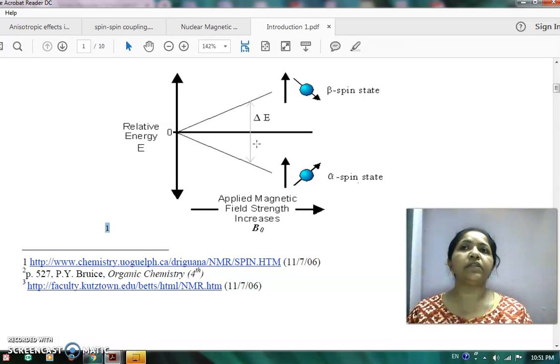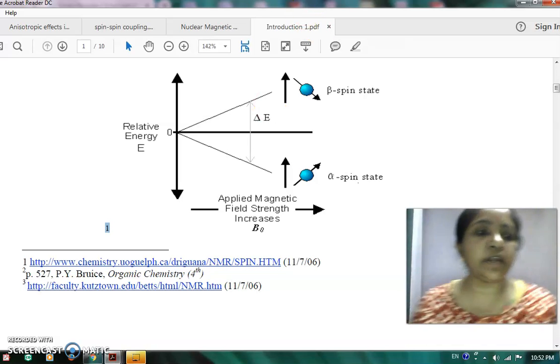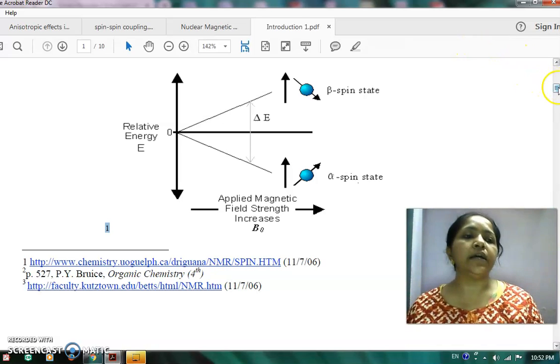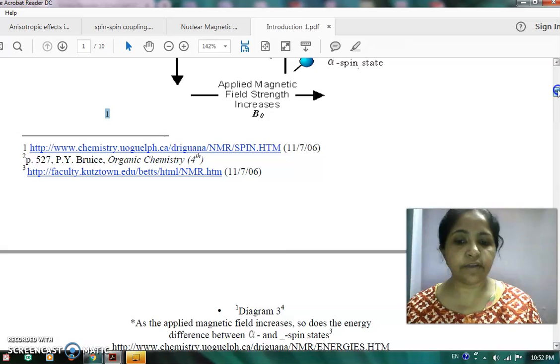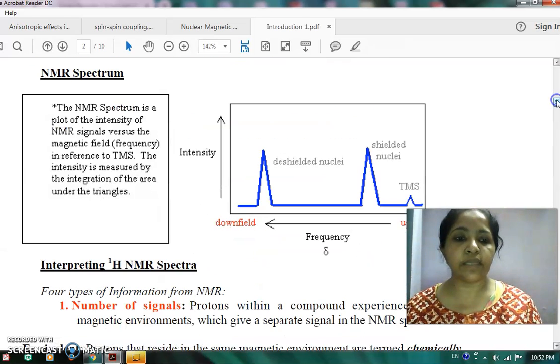Here we have the same type of hydrogen, hydrogens in the same environment, equivalent hydrogens, 12 of them. Therefore it is much easier to study the molecule in reference with the TMS.